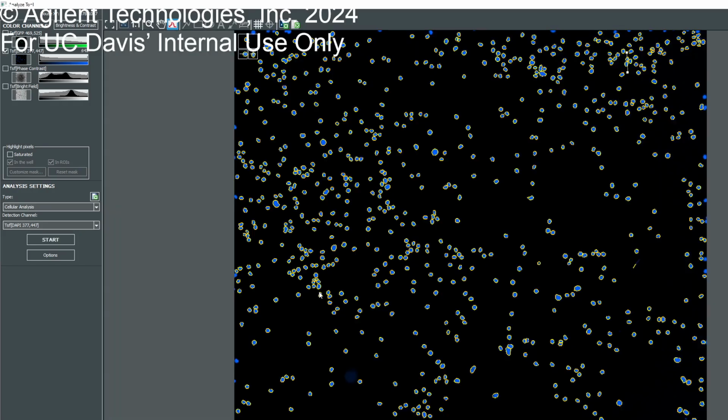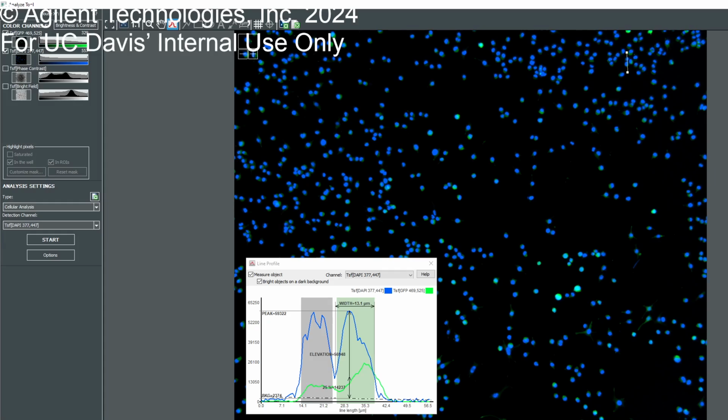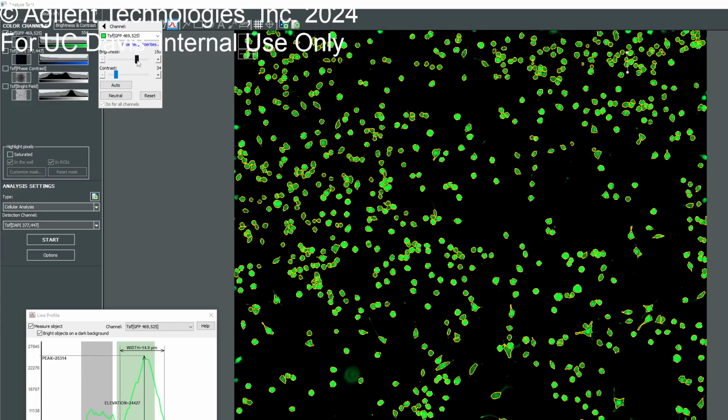And now let's look at the GFP image. So if you toggle the GFP on, uncheck the DAPI. Go to GFP, and check the secondary mask on, and uncheck the DAPI so it's easier for us. Maybe increase the brightness all the way, also on the top section. So we are missing out here, all of that. So now we can decrease the threshold.